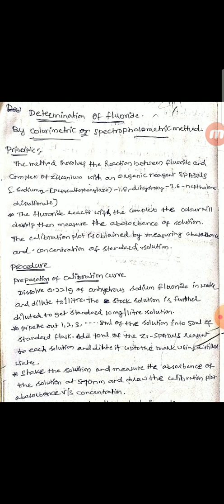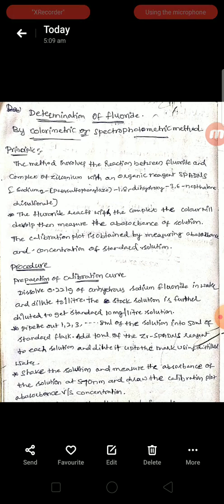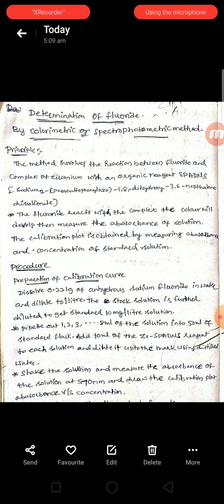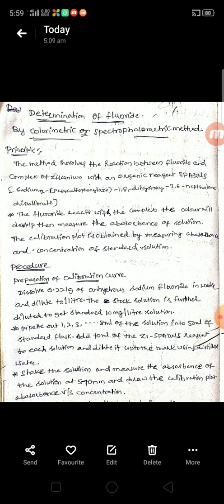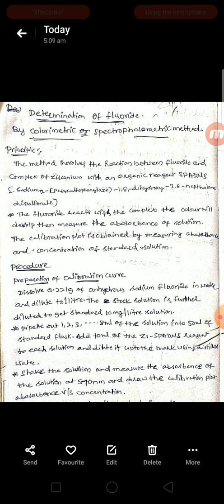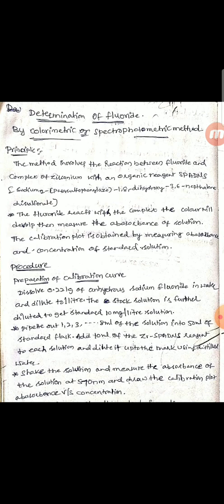To all 8 volumetric flasks, add 10 mL of zirconium spadens reagent, then dilute the solution up to the mark using distilled water and shake well. Then measure the absorbance of all the standard solutions and plot the calibration curve of absorbance versus molar concentration.